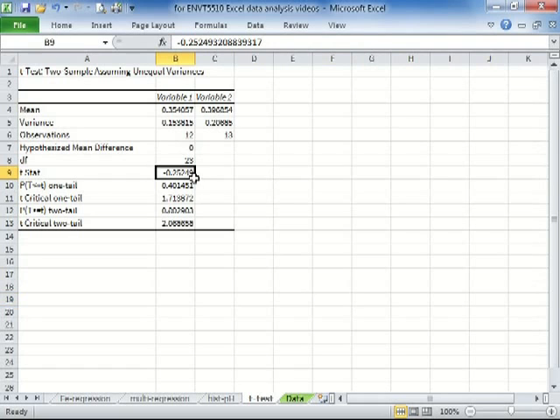Okay, so our t-statistic, the p associated with t, the one-tailed or two-tailed p-value, shows that our comparison doesn't show a significant difference between soils of high pH and low pH. Okay, so that's another thing we could do there.